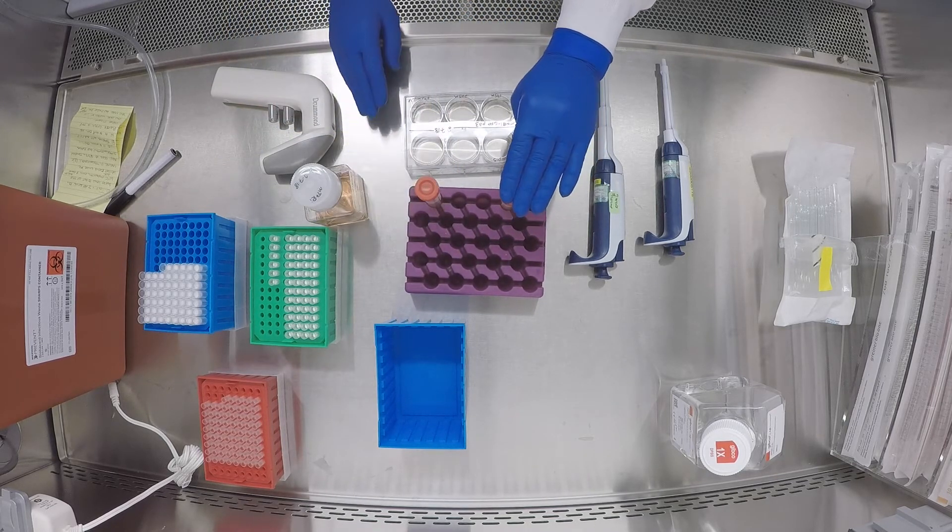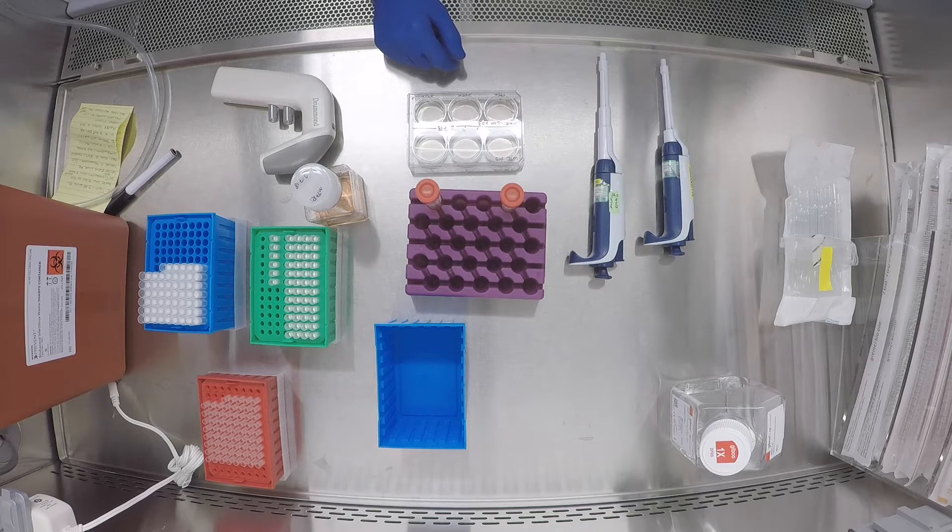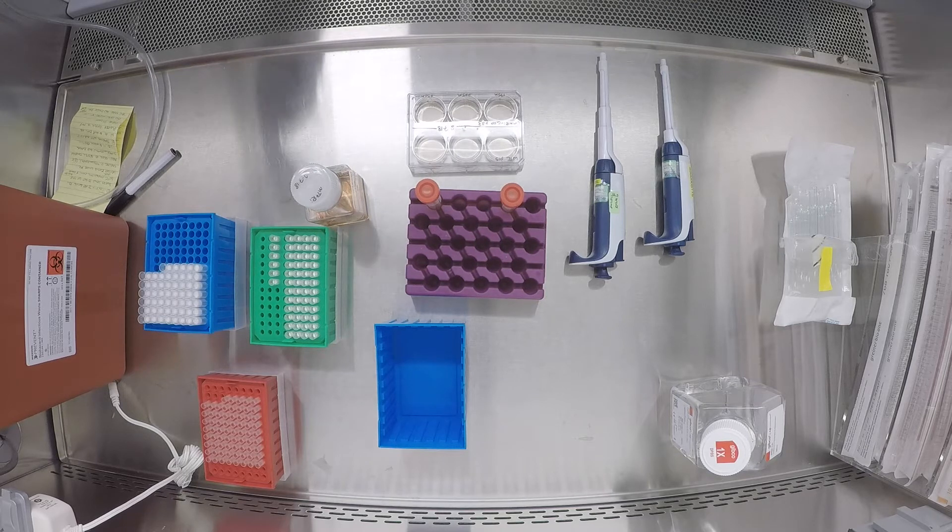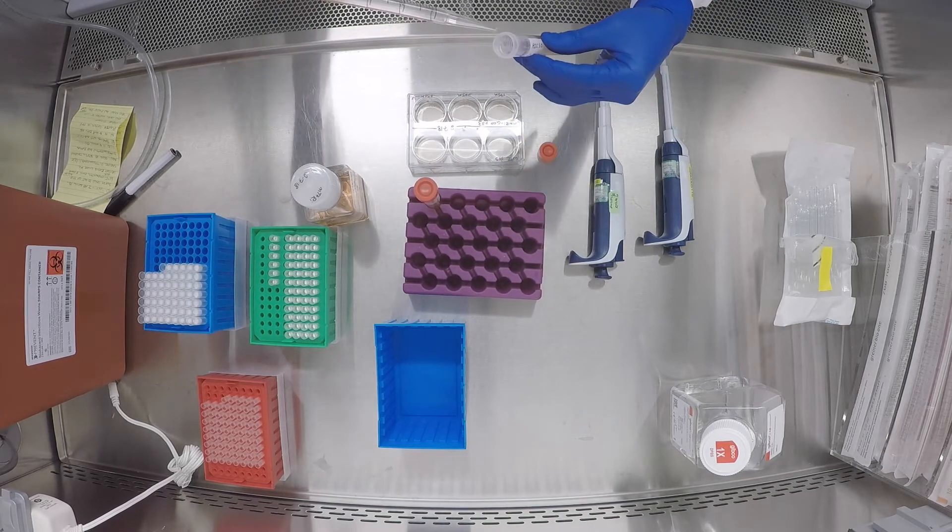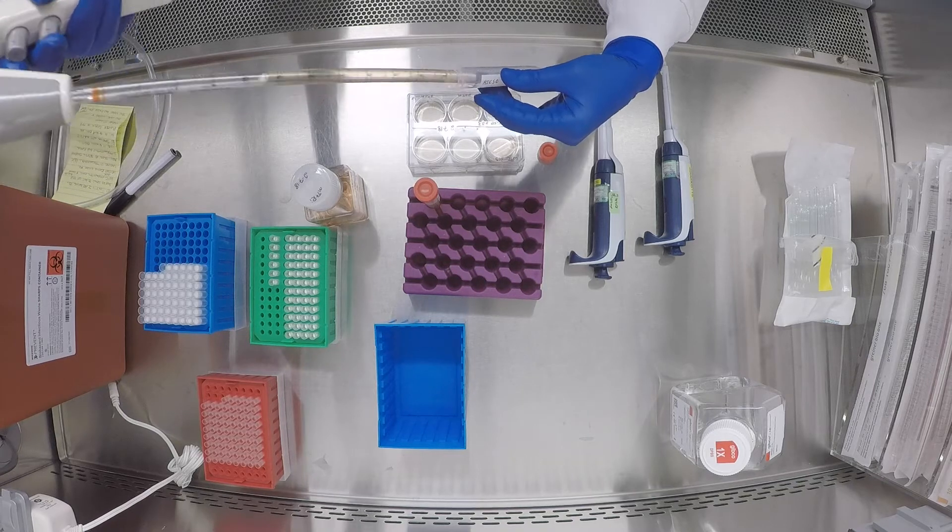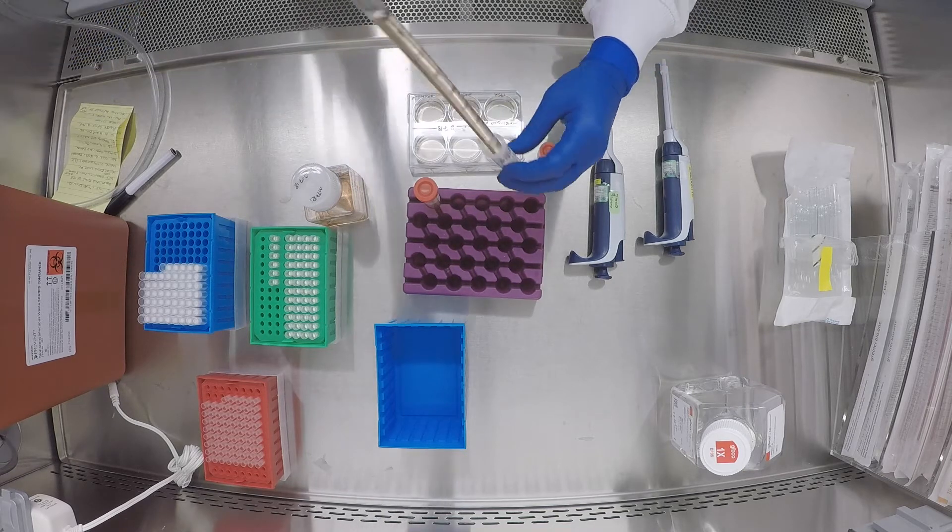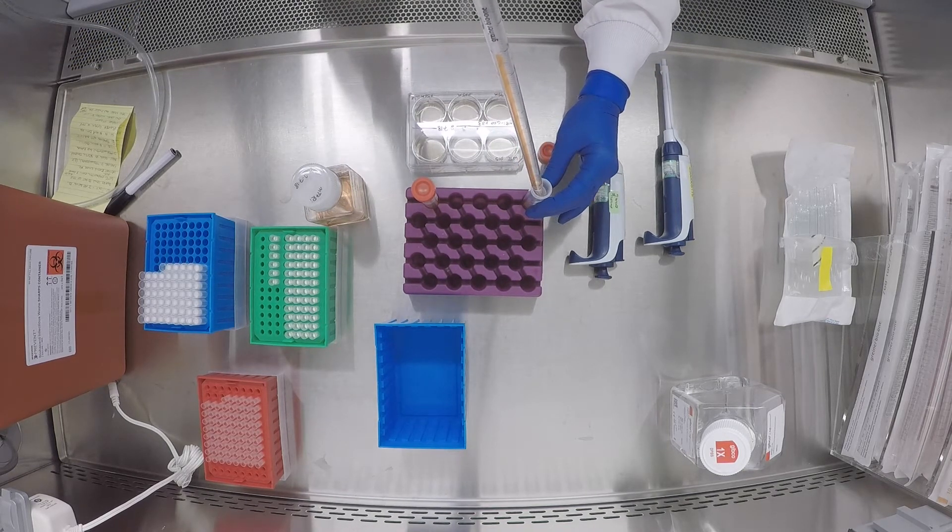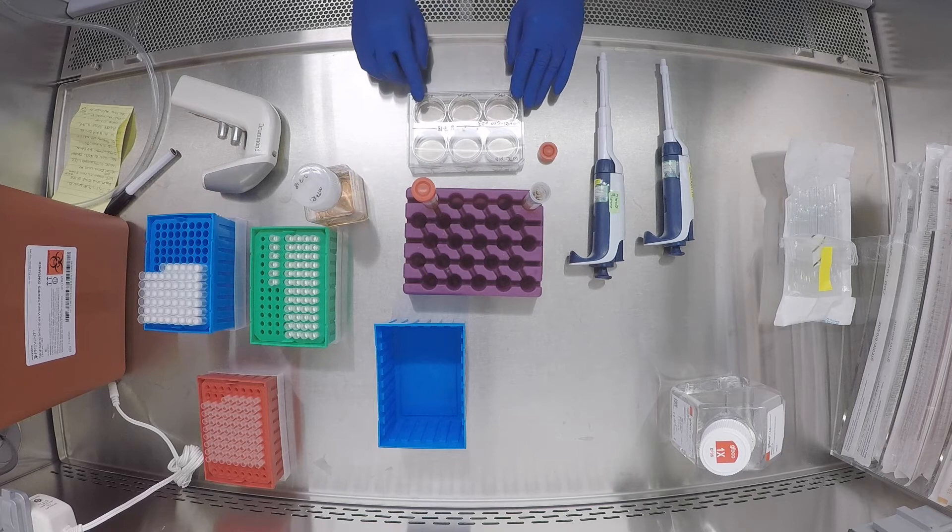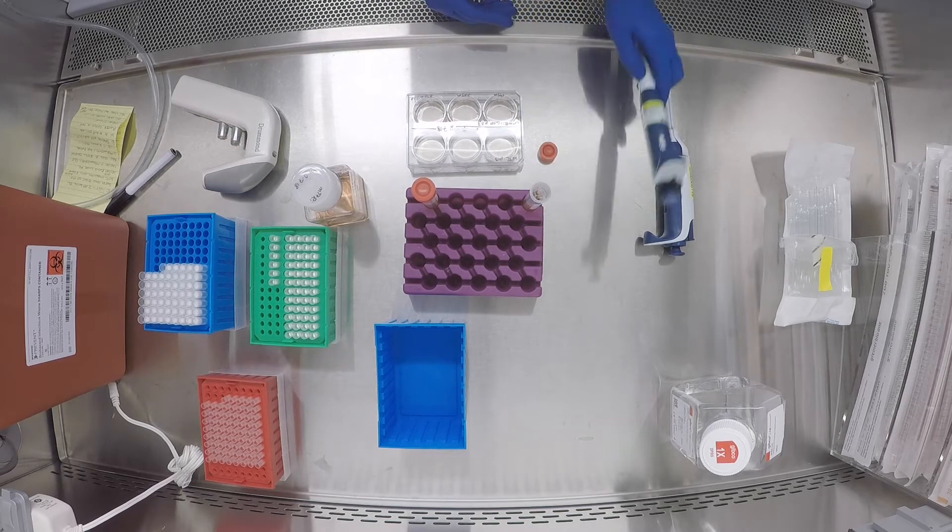Now I have my two cell lines, the WTC parental line and my gene edited line. Assuming that potentially I've had some settling in my cells, I'm going to gently re-suspend them again. I'm plating the cells in three different densities, 175, 225, and 250,000 cells per well. I've already made those calculations based on the concentration of my cells.